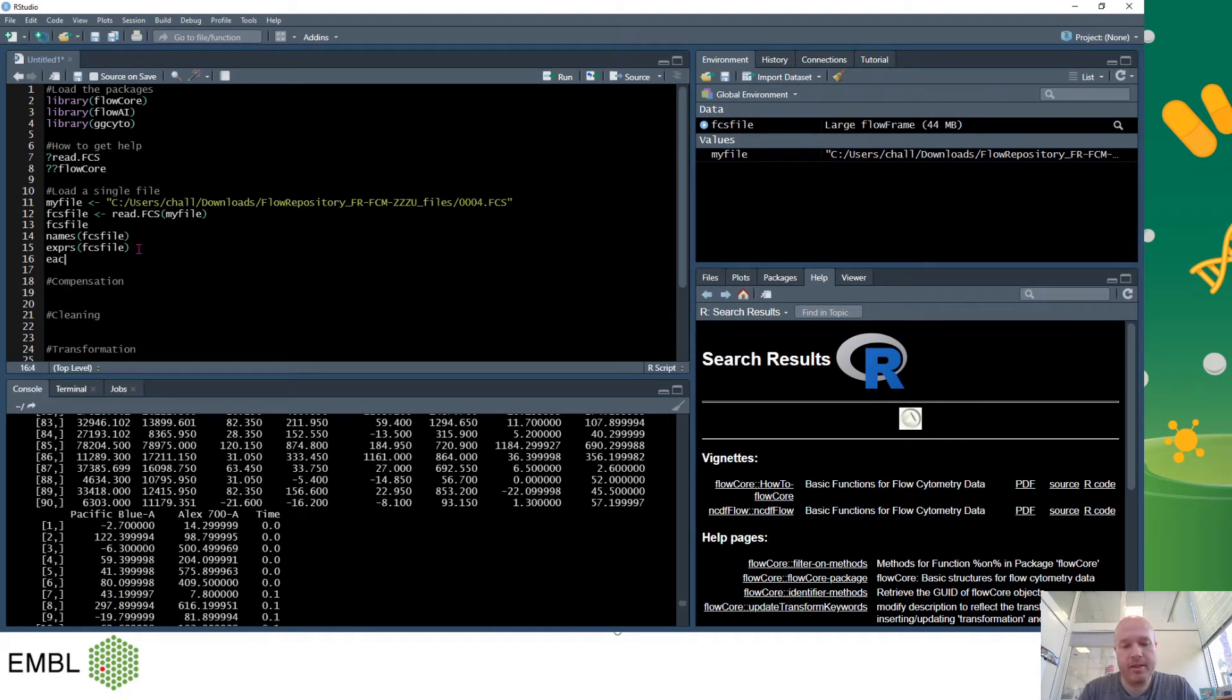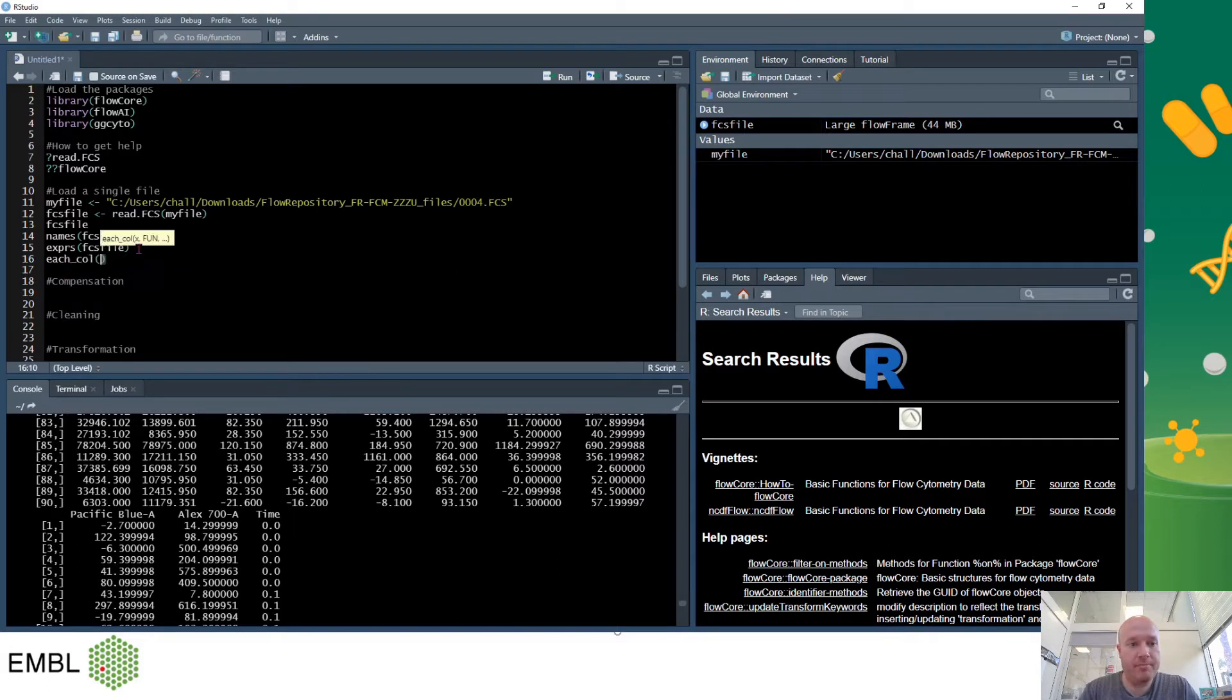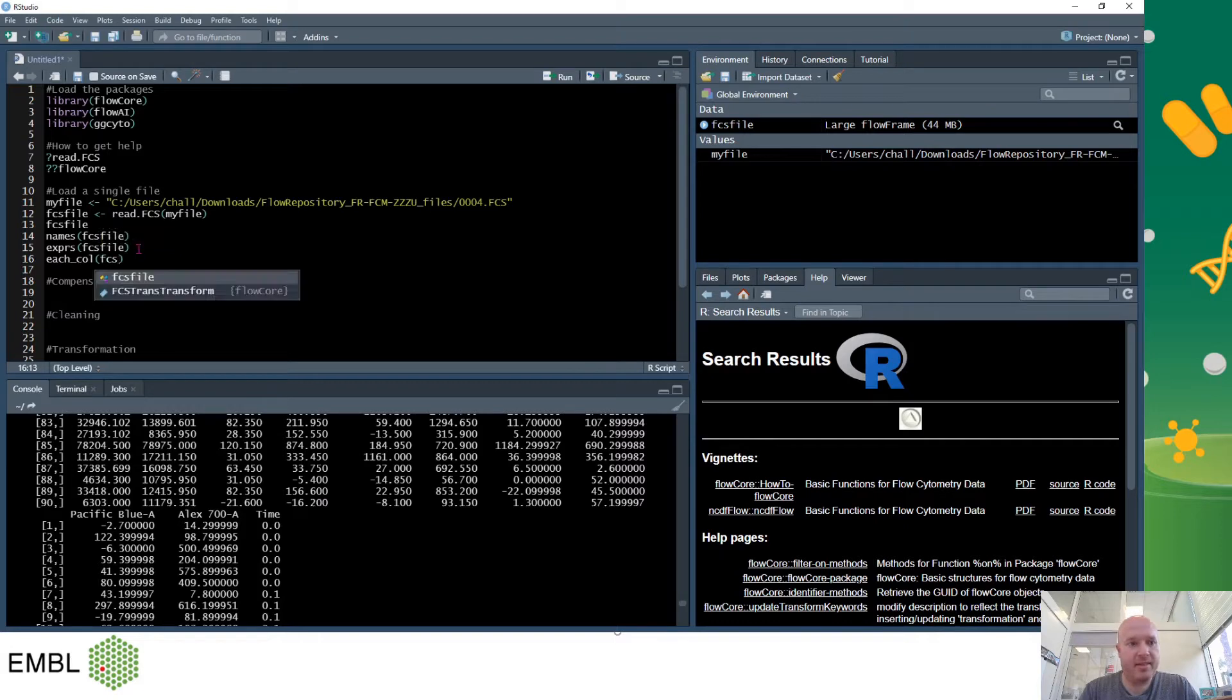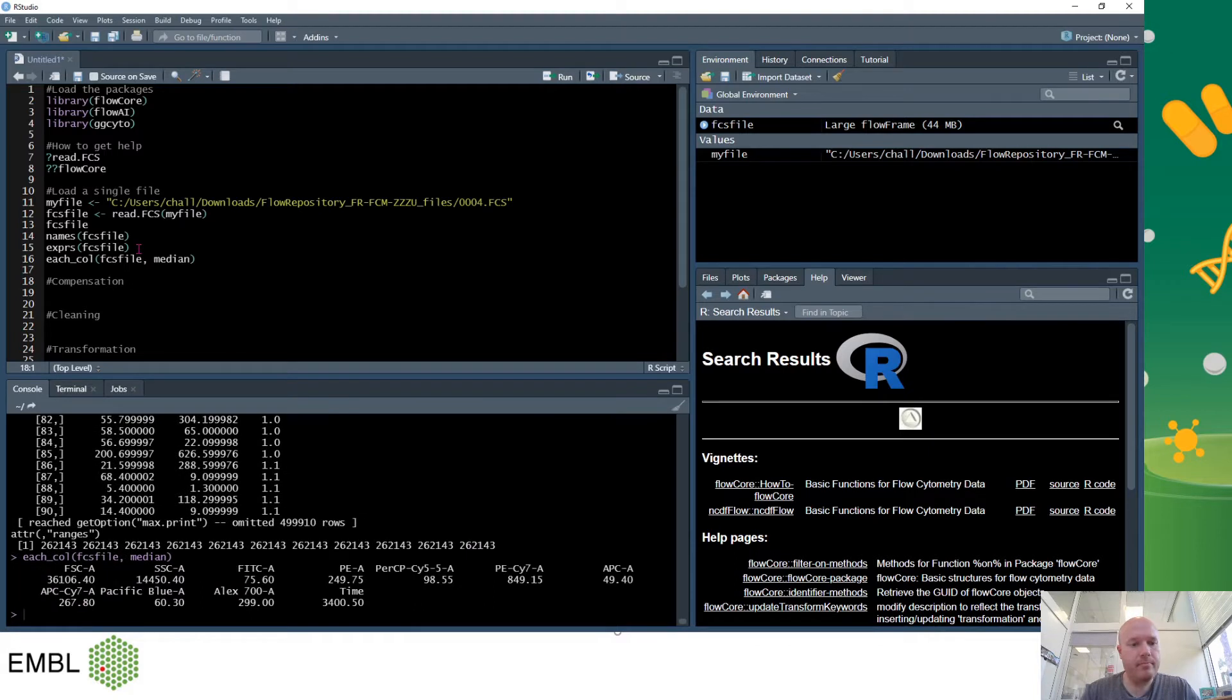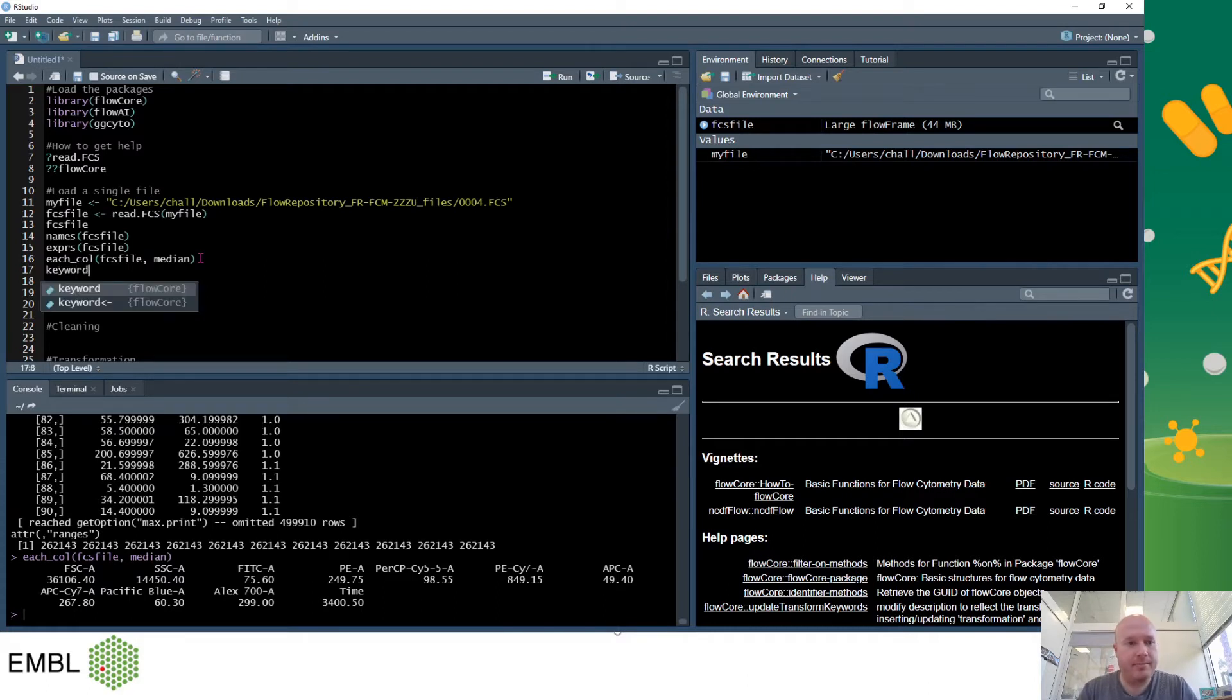The common commands are each col which will analyze each column of my flow cytometry data, so each parameter. So I could type in each col FCS file which is the file I want to look at and median and that will give me the median for each column.